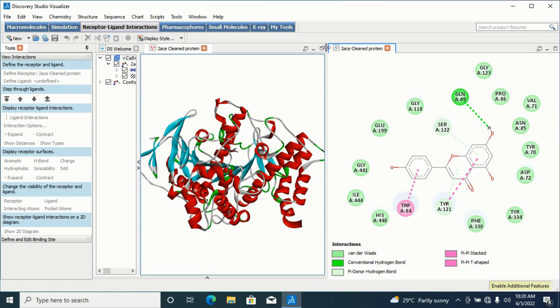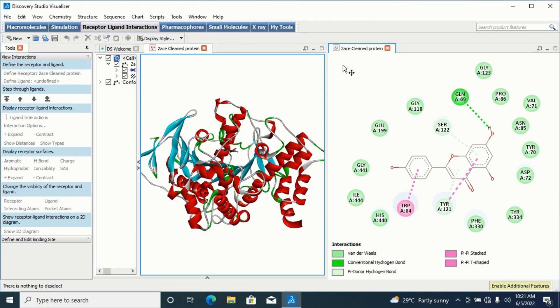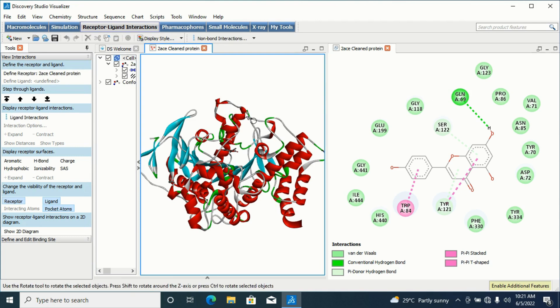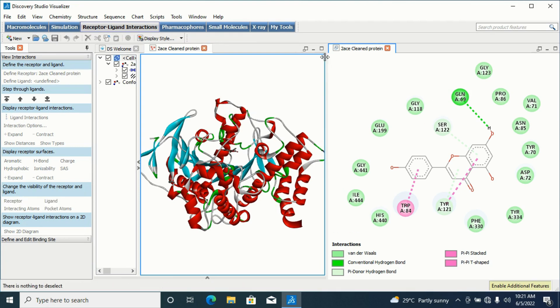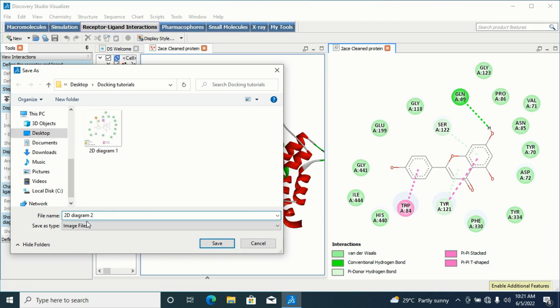While saving the result, make sure this particular page is highlighted. You have up to two pages here — if I click on one page it will be highlighted in blue. If you want to save the 2D diagram, make sure that page is highlighted before saving, otherwise you may save the wrong page. So I'll go to File, Save As, and title this 'Diagram 2', saving it as an image file.